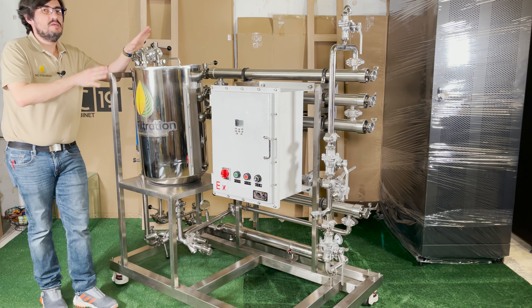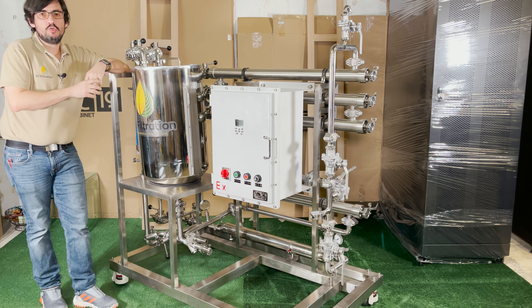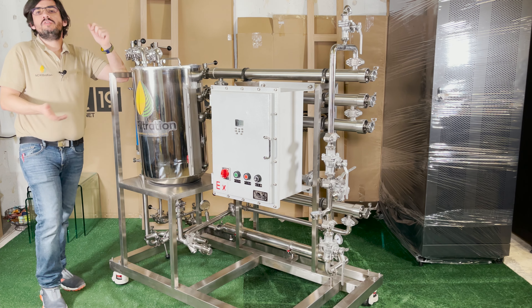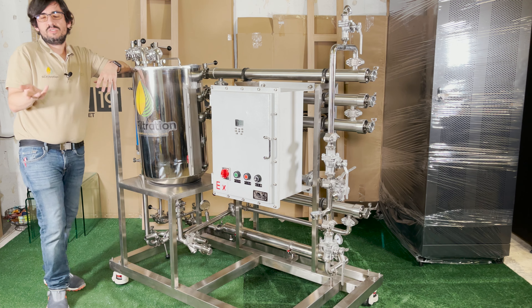So what's the typical SOP for using this machine? In this situation we're going to be doing solvent recovery. The typical SOP would be to take your room temperature micella, which is your crude mixed with a solvent — let's say ethanol in this case.